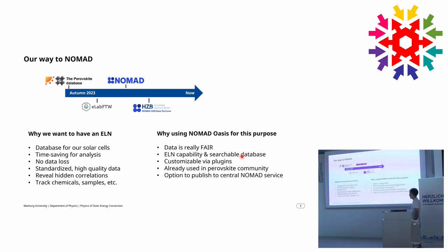And finally, also the option to publish to central NOMAD in the end is good, because then you have this open data thing in mind, and we want to share our data so we get the most together as a scientific community out of our experiments. Yeah, these are the reasons why we then said, okay, let's go for a NOMAD Oasis, and now we have a NOMAD Oasis here at Marburg.